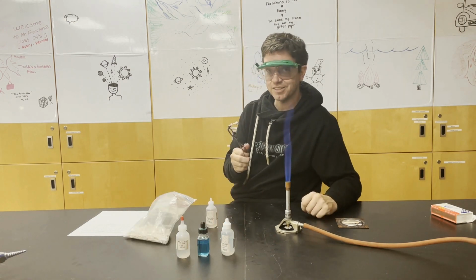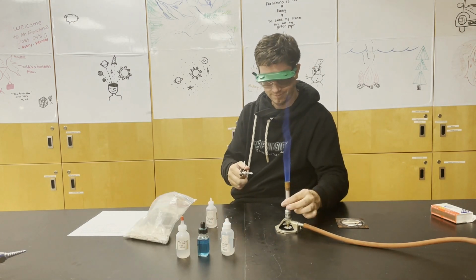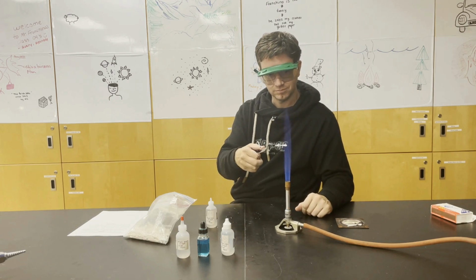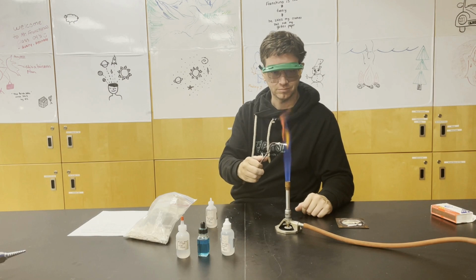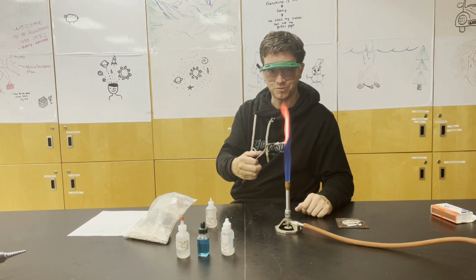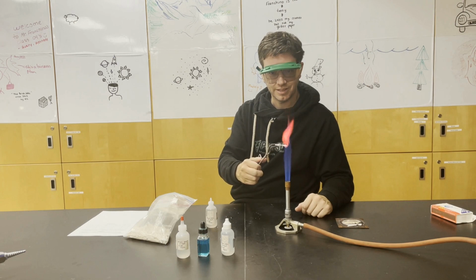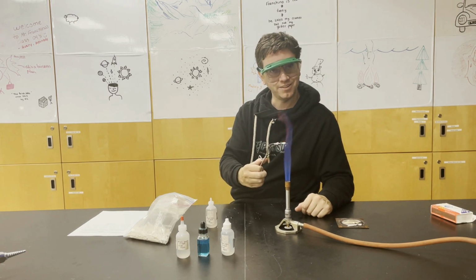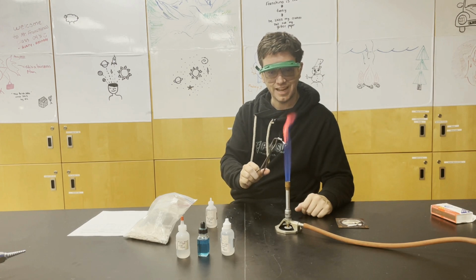Next metal ion is strontium. There's a beautiful red. Okay, I'll let you estimate the wavelength and then make the calculations for the energy of those photons.